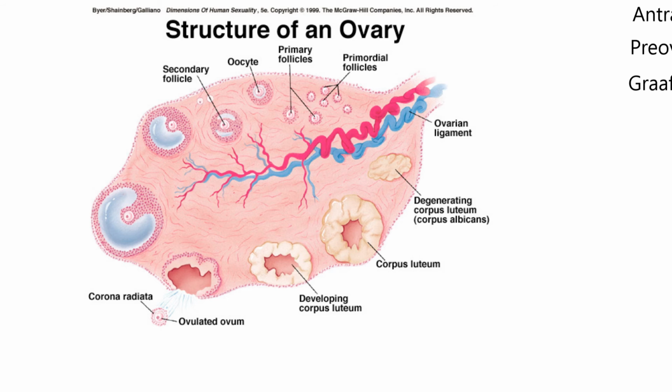They get bigger. Now this gives you an idea that they might travel that far as they're growing, and that's usually not the case. Watch my red pointer. A lot of times they start up here as primordial. They might shift down here and start developing, and then they might pop up near the surface. They really wouldn't travel this far, okay?